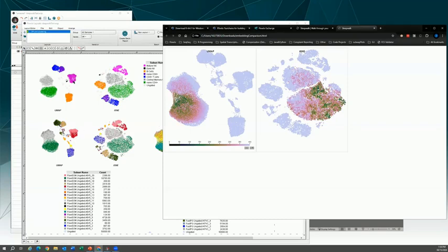Here in UMAP and t-SNE, we have mature NK, and with FlowSOM clusters, it split that into 2 different clusters. I wasn't able to gate that apart with what I had done previously, but the clustering separated that area, along with in t-SNE space as well.